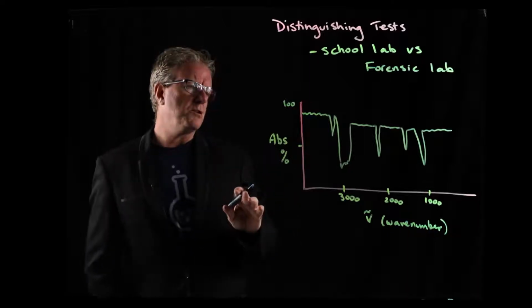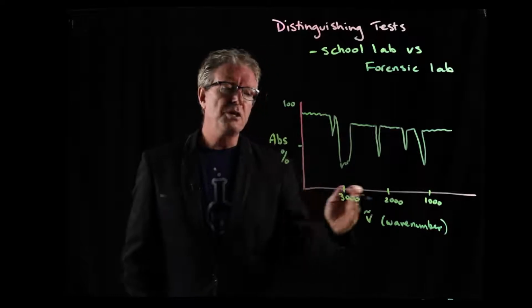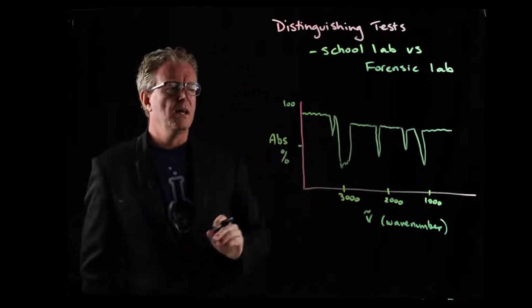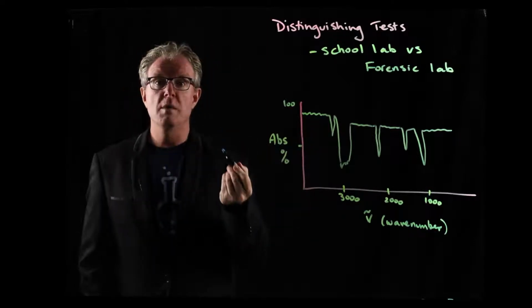However, here what we're going to be doing is talking about a range of wavelengths and frequencies over which we measure the percentage absorbance. And the fundamental concept here is that bonds absorb energy.